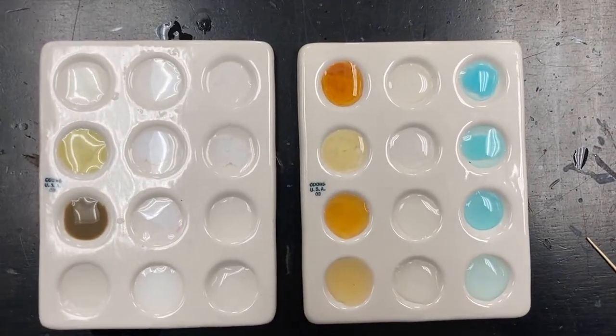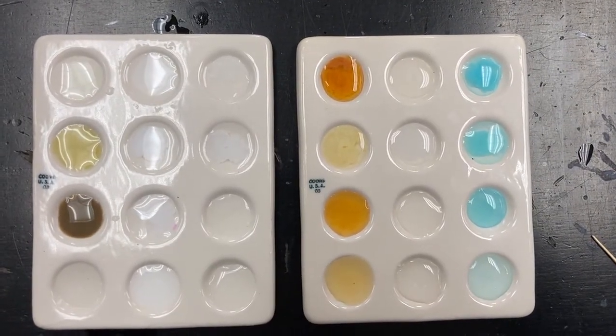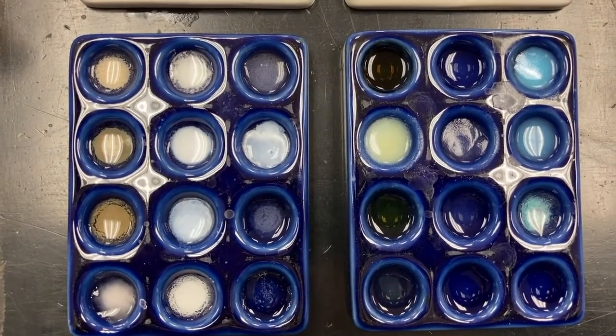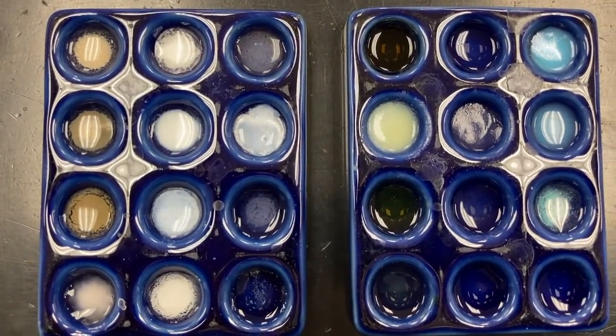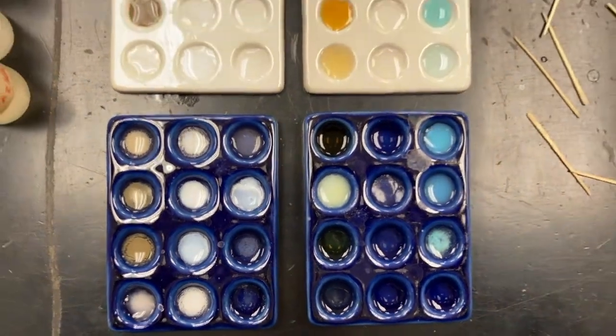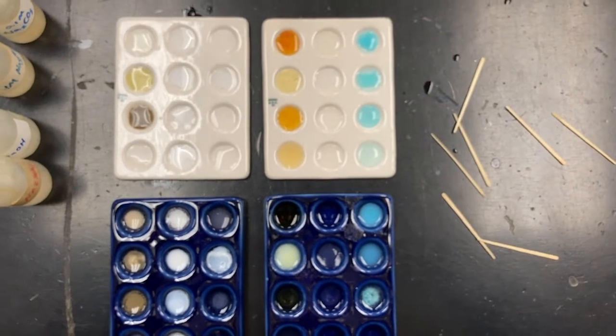So those are the overall colors with a white background. And then right below them, those are the overall colors with a blue background. And here they are together.